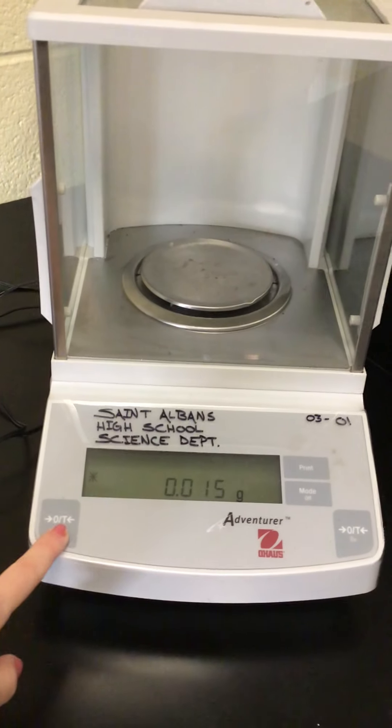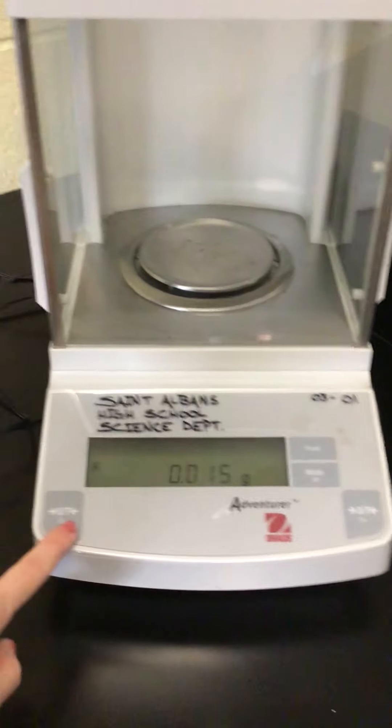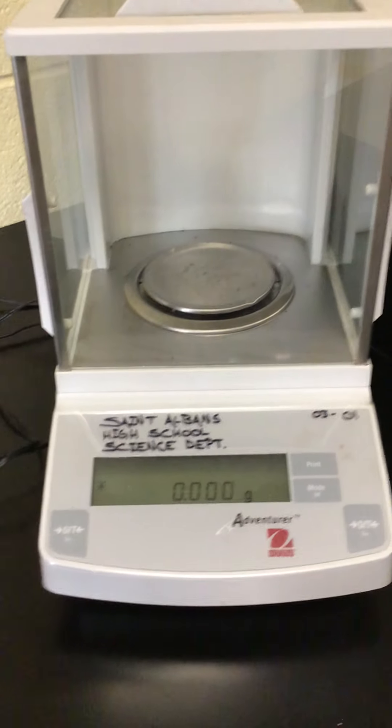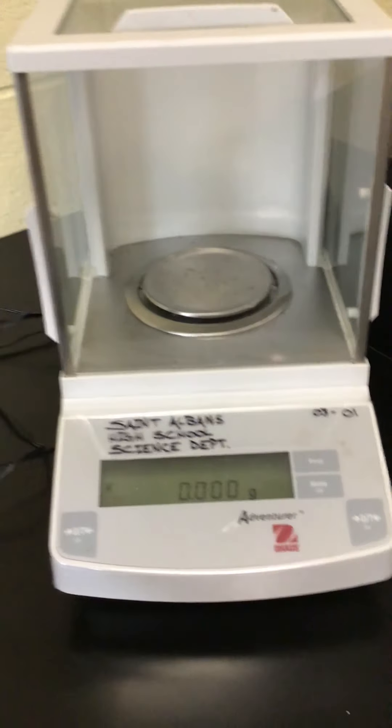And so my button on the scale right here is T for tare. I actually have two different ones. I'm just gonna hit it and it now says that it's 0.000 grams and I'm free to go through and weigh something.